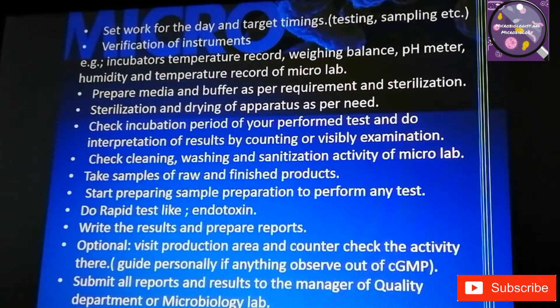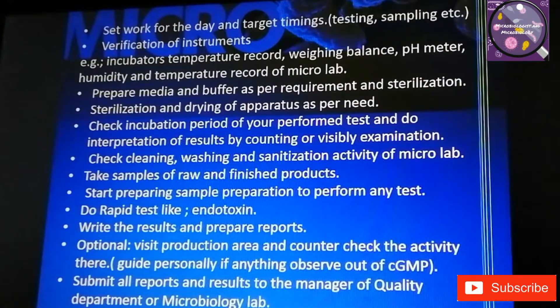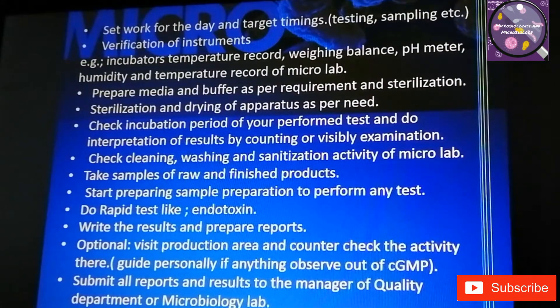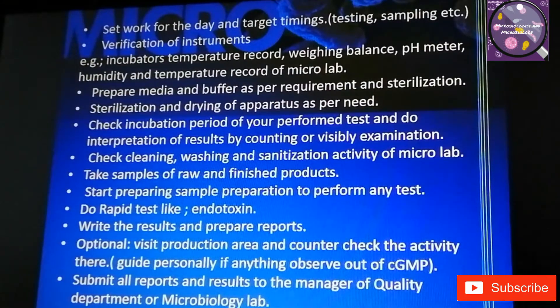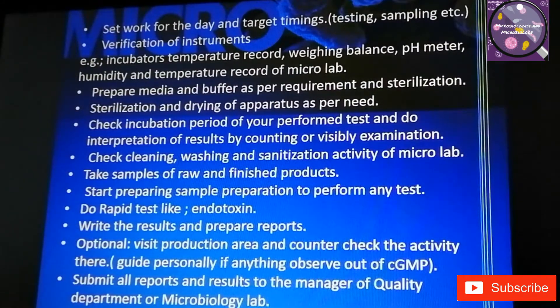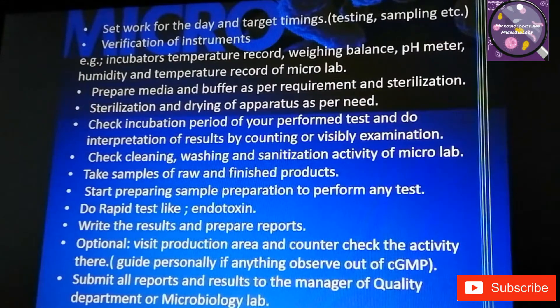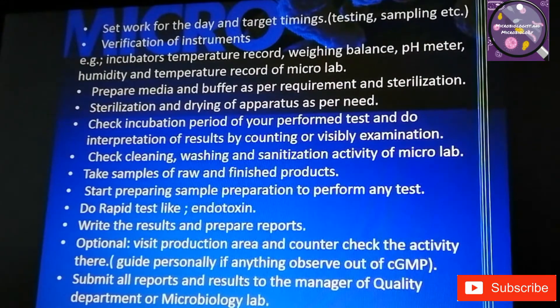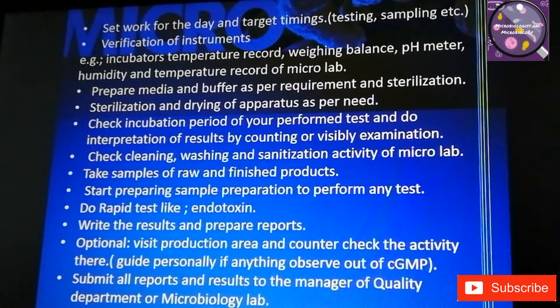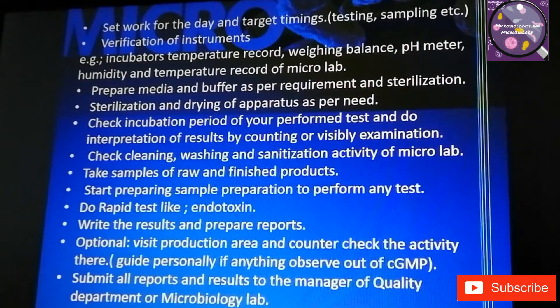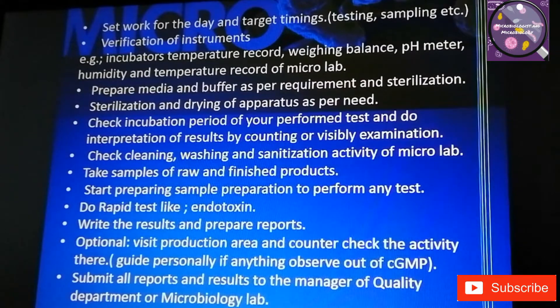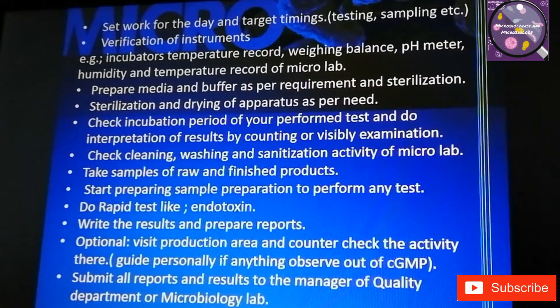What we usually do first is verification of instruments — like incubator temperature records, humidity and temperature records of microbiology lab rooms, weighing balance checks, and pH meter checks. Then, as per the requirement and testing work, we prepare media and buffers and perform sterilization and drying of apparatus as needed.